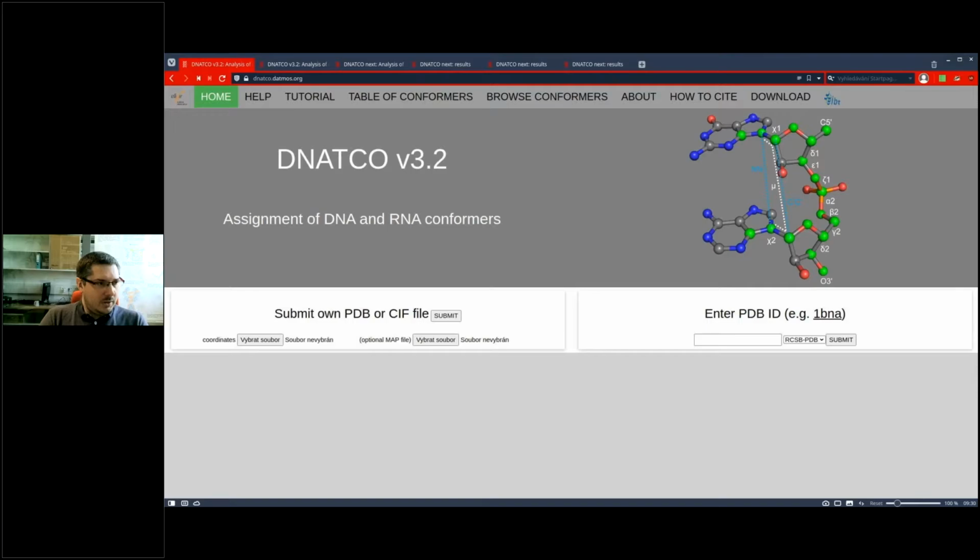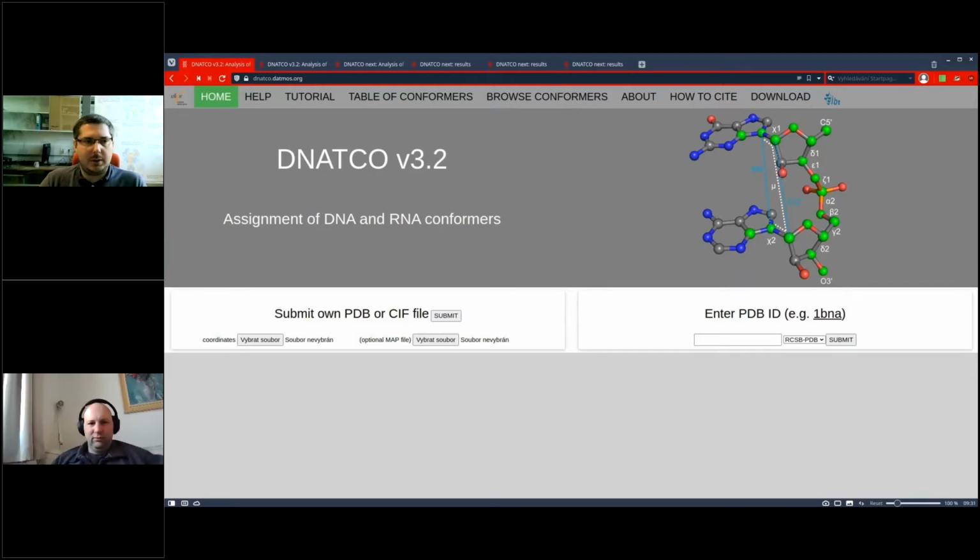Yeah, so good morning and thank you for the introduction. So as you already heard and read and seen, today I'm going to talk about our web service DNATCO in the public version 3.2, and also I'll show you the next one.